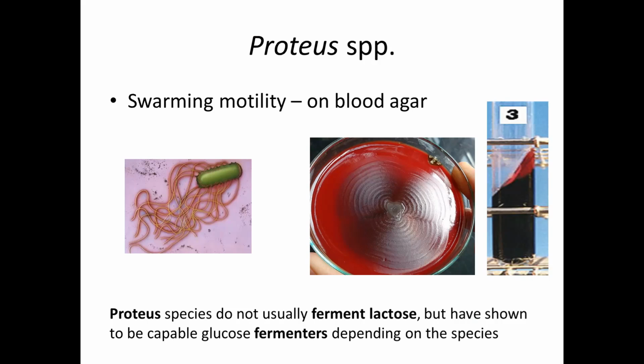Once we have differentiated using phenotypic characteristics, their colony appearance and Gram stain properties are almost the same, and colony appearance is not a strong one. We go with biochemical characteristics, like growing them on MacConkey agar, CLED agar, and even KIA. We check their ability of differentiation, using lactose fermenting ability, weak or non-lactose fermenting ability, and also a motility test if required. We do the differentiation of these organisms. That's what we are expecting in the practical.